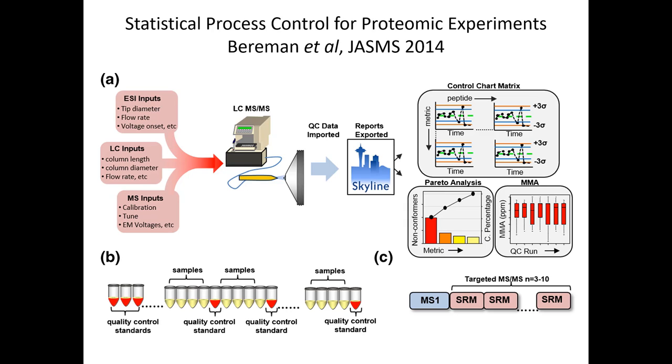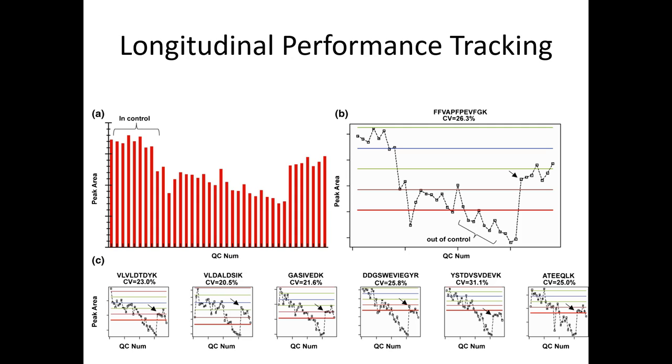And then also mass accuracy plots, if you have high-res accurate mass. And so this used to be something that was just in Skyline, then it became QC My LCMS, I think, was a website you could go to, and now it's integrated with AutoQC, which works pretty automatedly, and Lindsay will go into details about that.